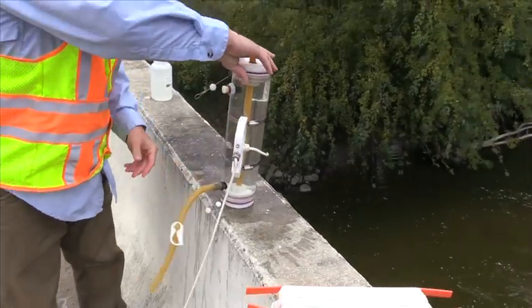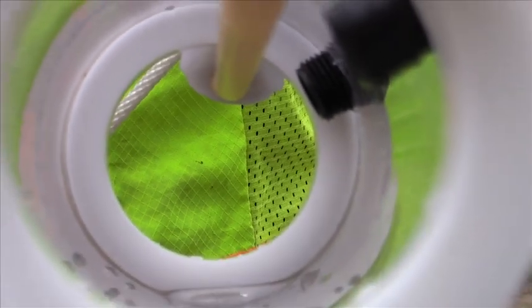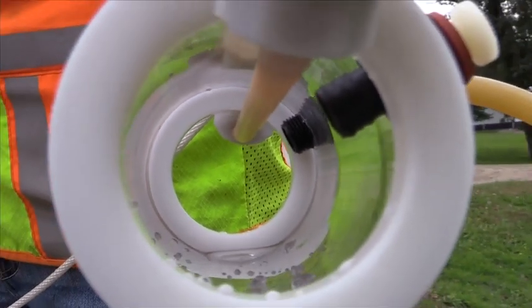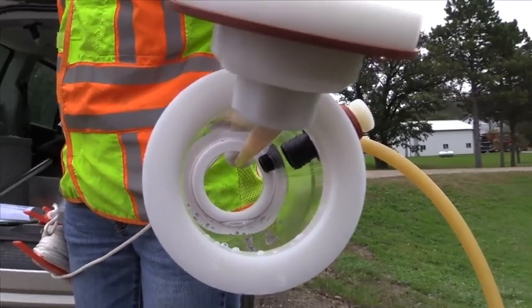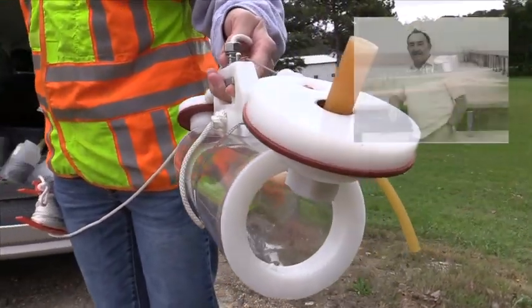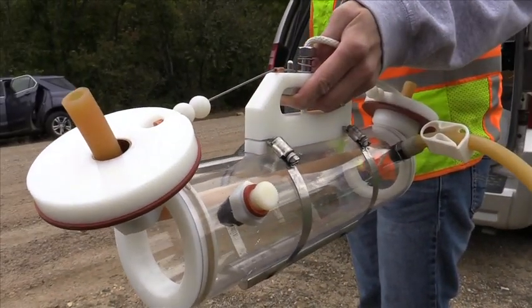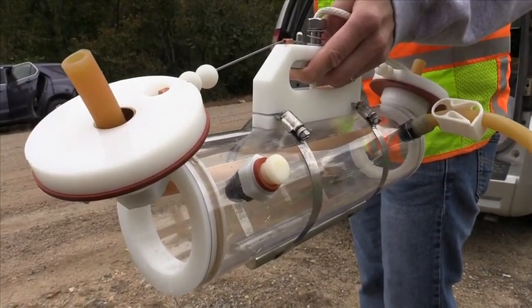This program provides a tutorial on how to use a Van Dorn sampler. Most of the sampling sites in the network use a Van Dorn to collect water samples. And here's some trivia — this equipment is named after Dr. William Van Dorn of the Scripps Institute of Oceanography at the University of California in San Diego.